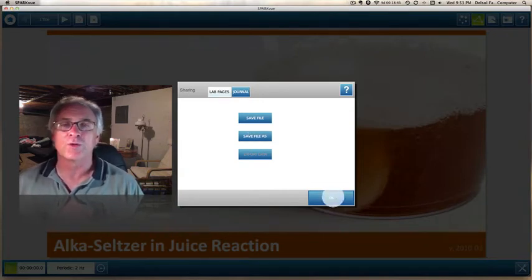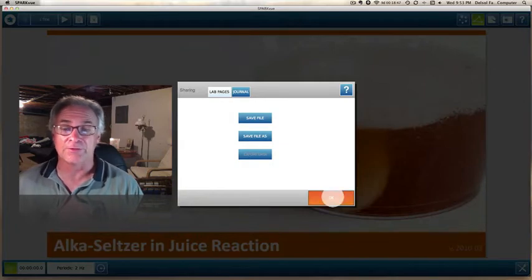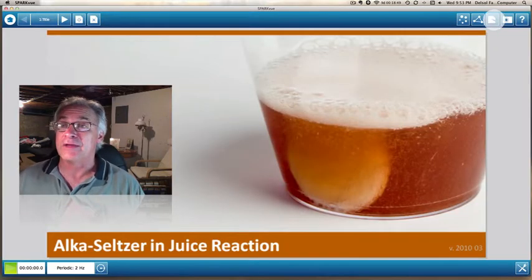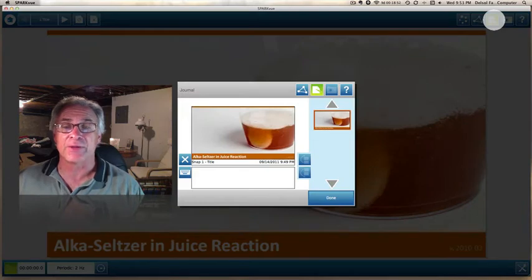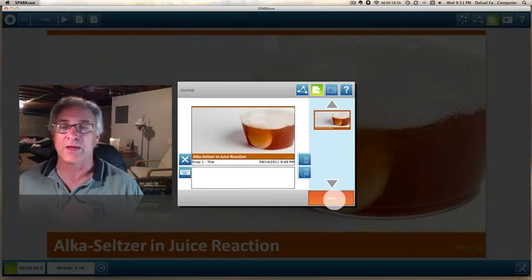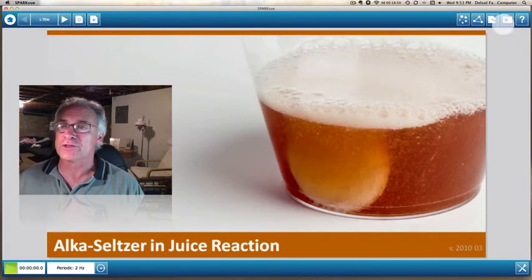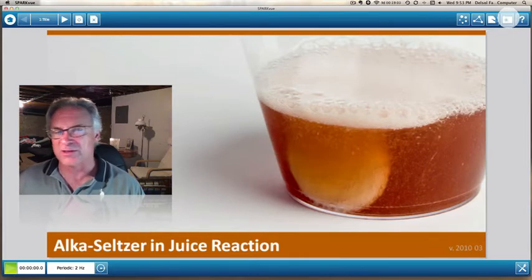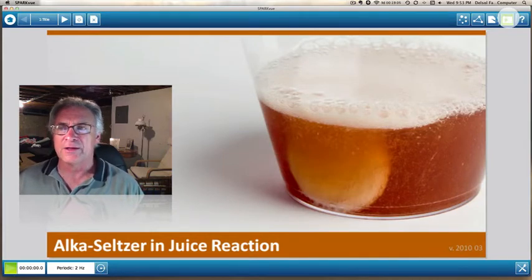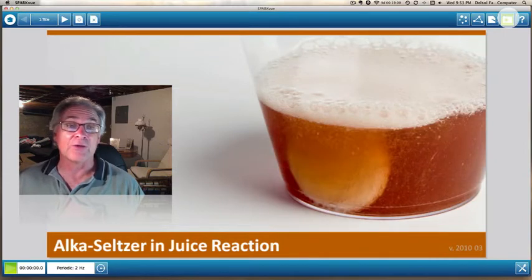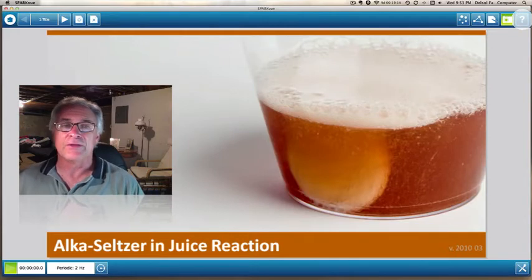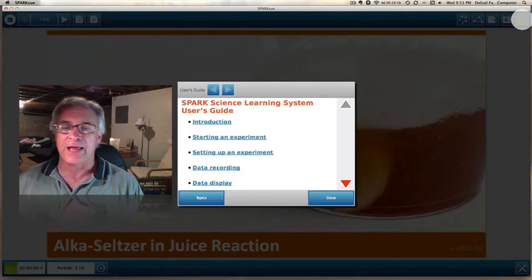Most of the time, we're going to be saving on a USB drive or thumb drive. And then this allows us to actually see some of the pages and what they look like. And this picture right here is called the snapshot page. So if you take a picture of, let's say you want to save your data, you take a snapshot of it. And when you do that, it will allow you to save the information on your particular page.